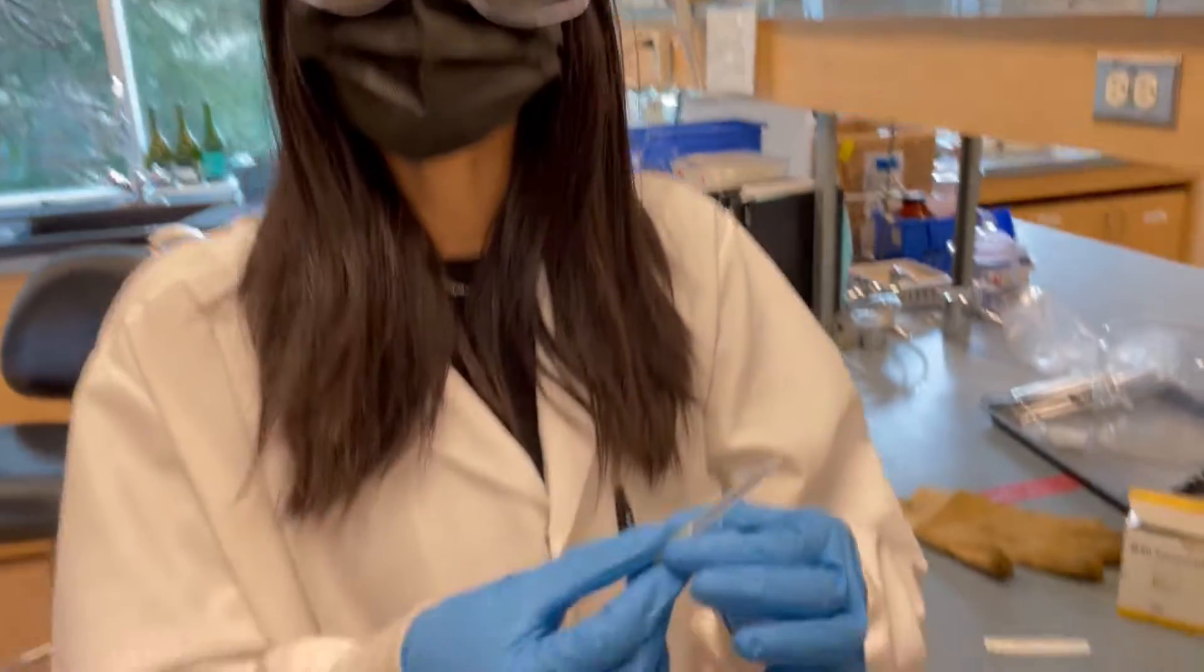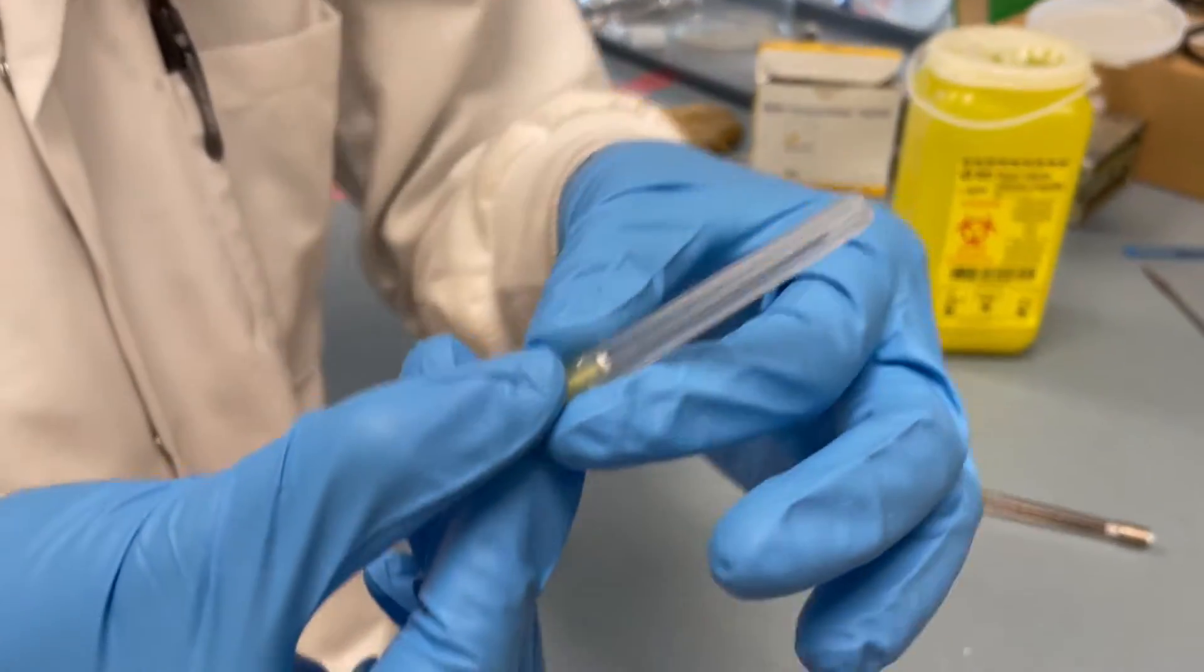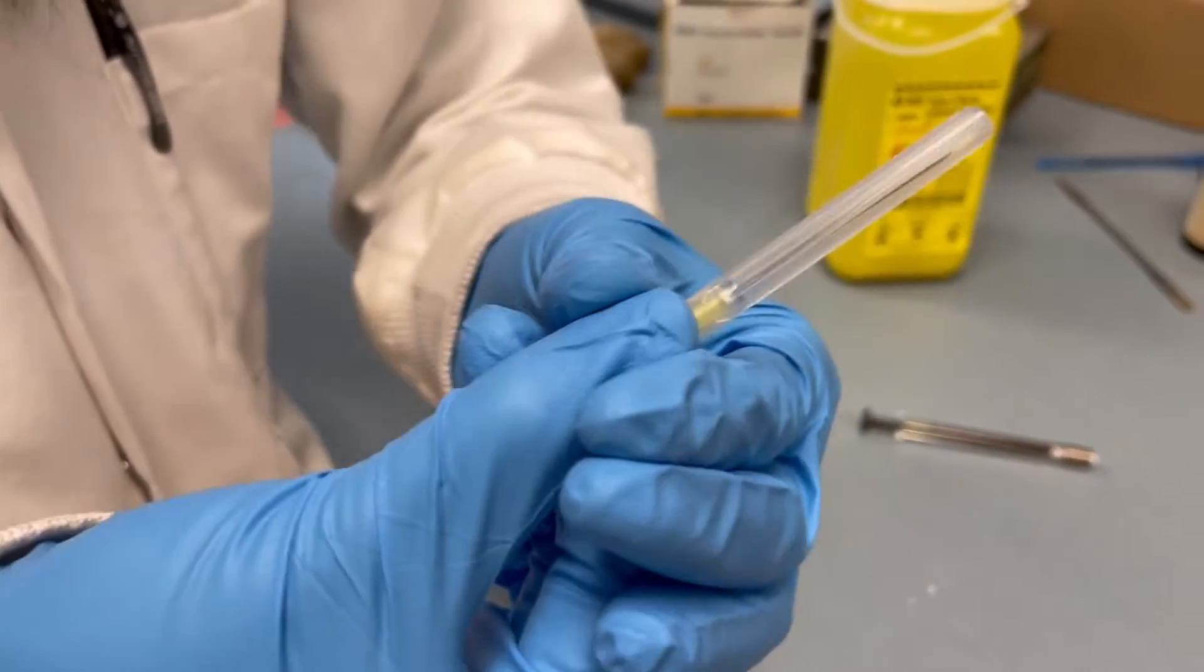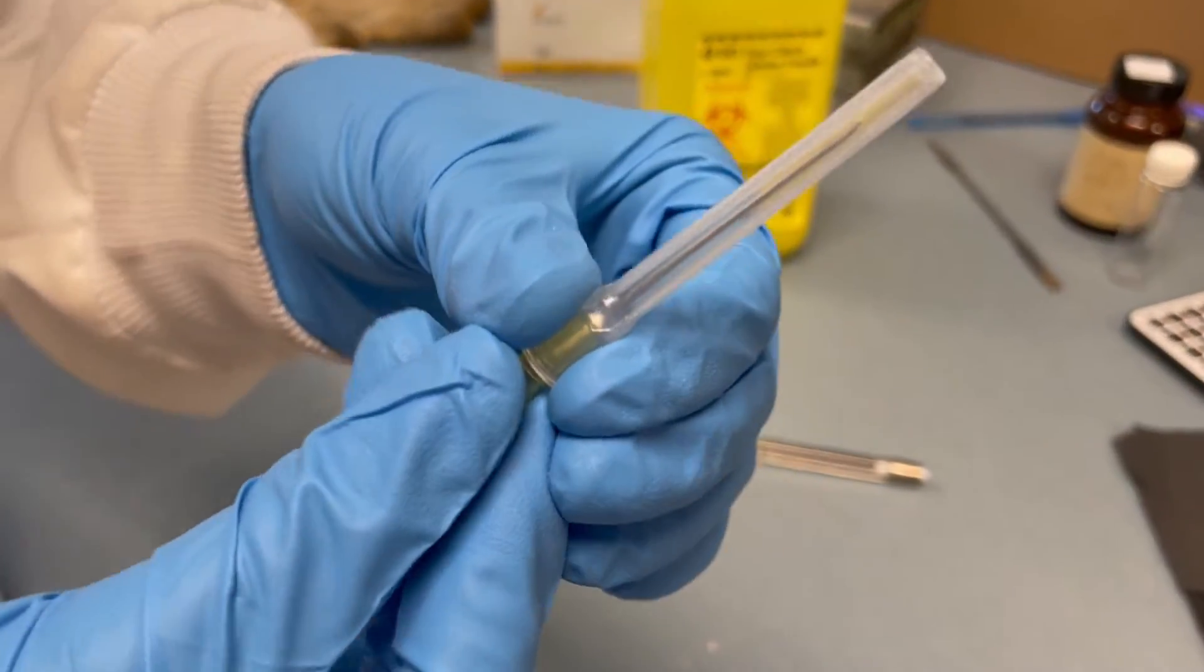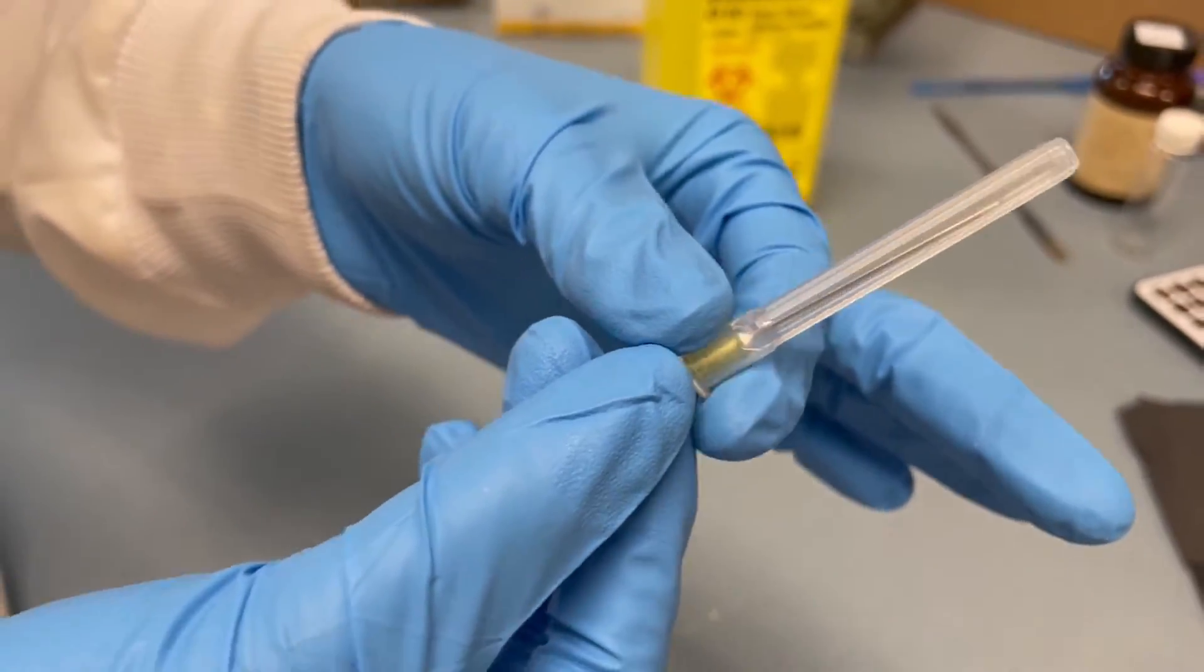When uncapping needles you shouldn't apply excessive force because when pulling the cap off it might cause your hand to come back and result in an accidental stabbing. Instead you want to lightly twist the cap and that'll cause it to come off.